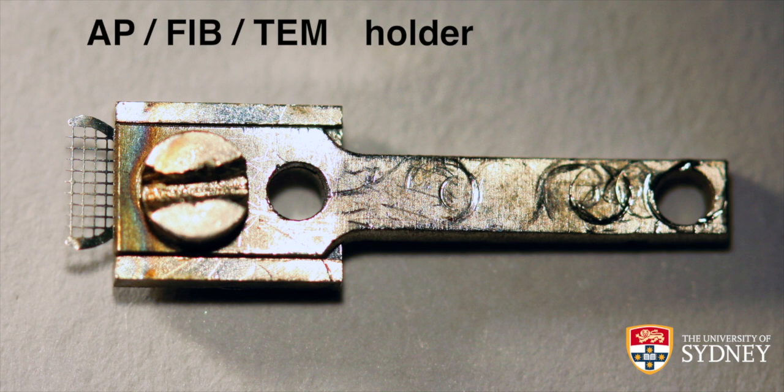As a support structure, we're using molybdenum TEM grids. So the grids that we're using are SPI 100 mesh molybdenum grids, simply because they have a 30 by 40 micron cross-section, which means they have a cross-section that's almost a square, which gives you relatively round pins when you electropolish them. And we've got our special holders that you can see here, which allow us to move the specimens later between the focused ion beam system and the transmission electron microscope and the atom probe without any problems.